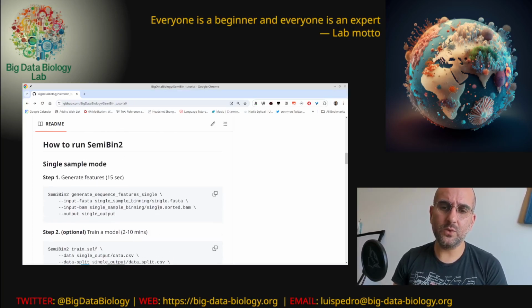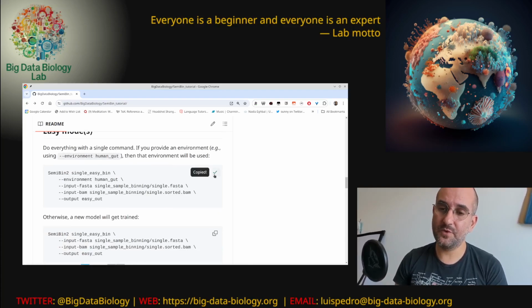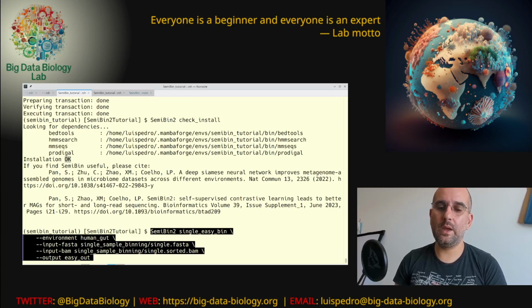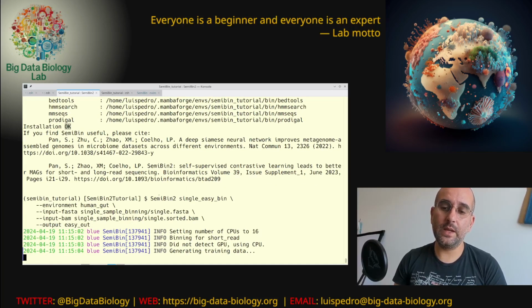So I'm actually going to skip ahead and I'm going to run this in easy mode first. I copy this. So here again, SemiBin2, the subcommand is single_easy_bin.